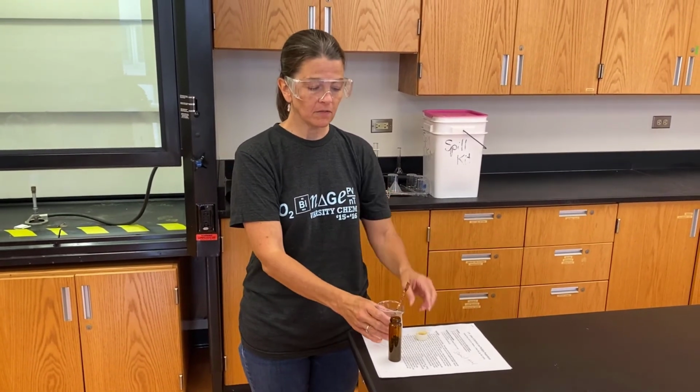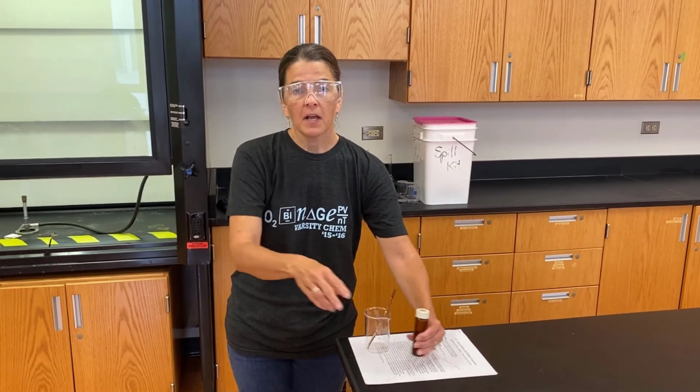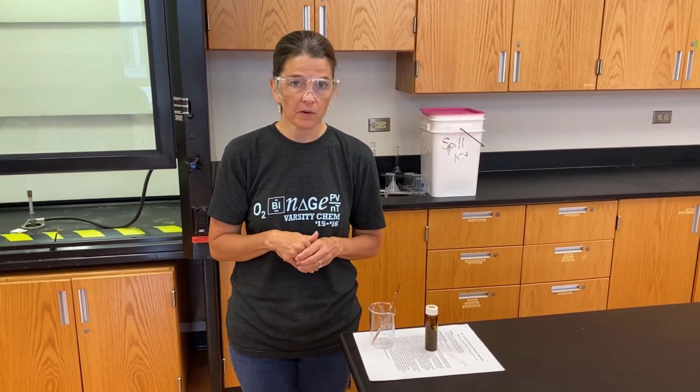Those are the three pieces of data that you'll see. You're going to see multiple trials with data. So you're going to look for which trials give you a consistent result for your compound and which trials are in error and maybe why.